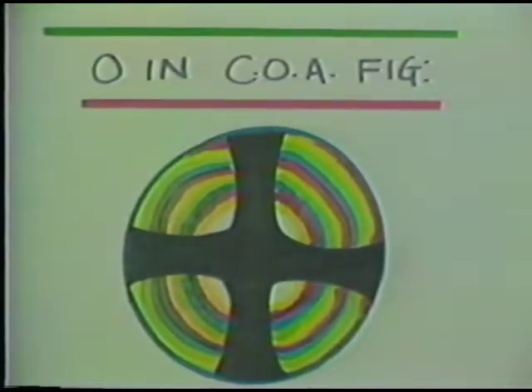Here's the centered optic axis figure shown schematically, and it typically has this two-isogyre pattern and a series of color curves that are emanating out from the center of the figure. Now, you can't miss finding O with this kind of figure. The figure doesn't even change with rotation. This is the circular section of the indicatrix, and so any grain that shows this kind of figure in any orientation, you can measure O. So it's a cinch if you find this kind of figure.